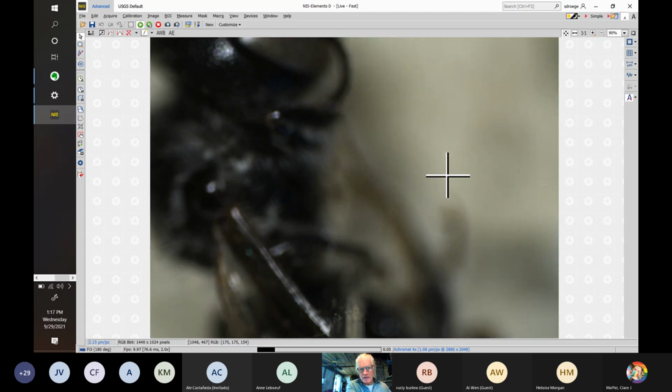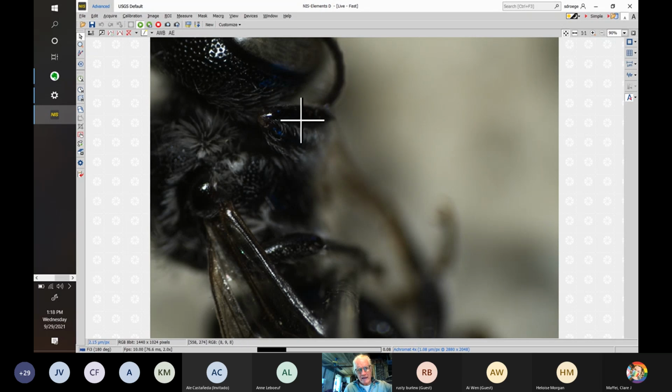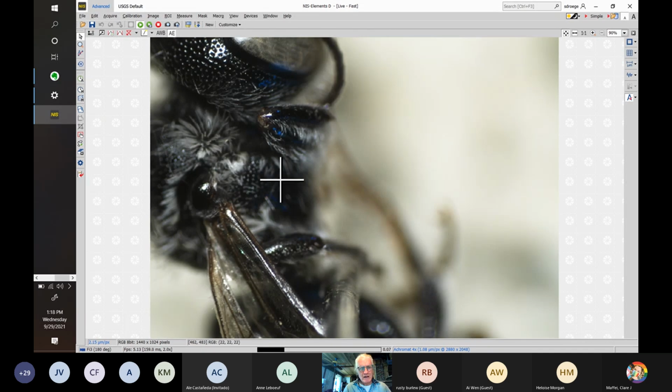So as dark bees go, again, we run into these problems where seeing detail within the dark areas is difficult. So there, the front leg is tucked up into this area. Again, just not getting enough light in there. Oh, that brightened it up some. So the carina is here. This is bare, but it's this face here and this face here. Very sharp line, I guess, is the point.